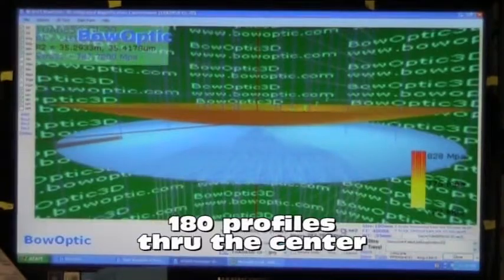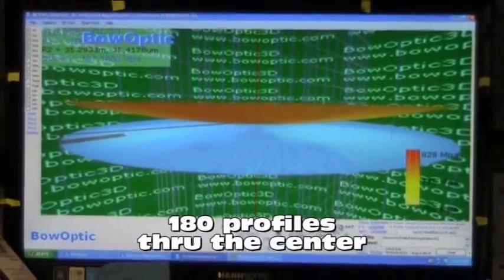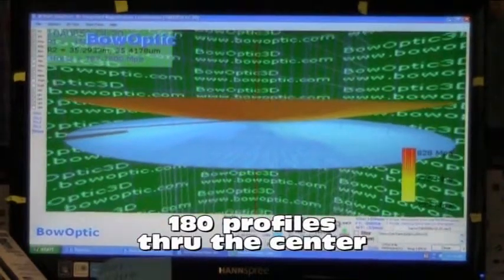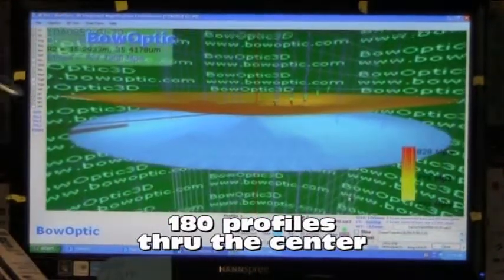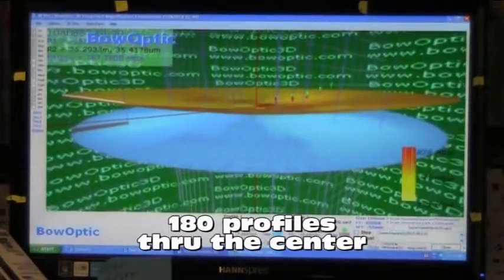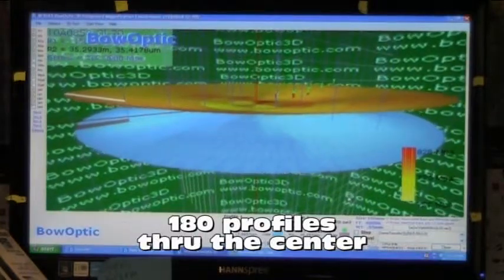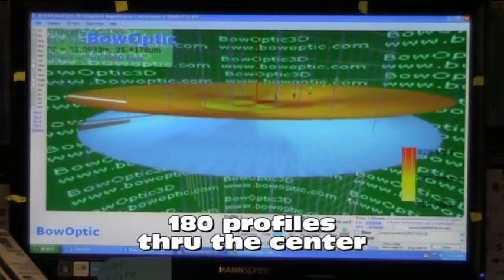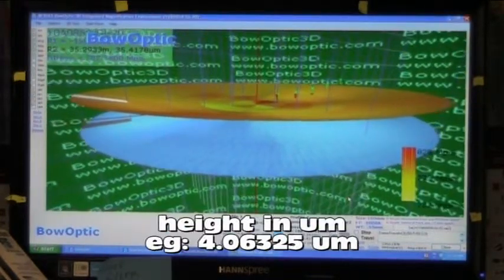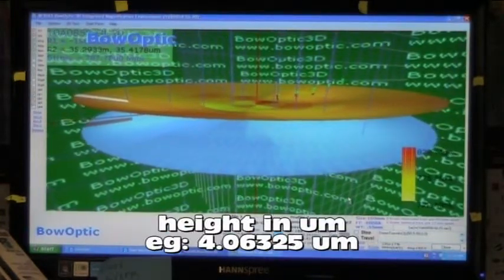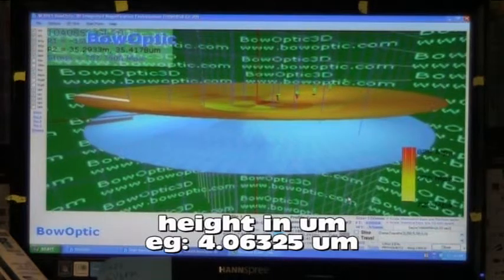The 2D profile is part of the output data of the BOW Optic 208. There are 180 2D profiles in the output data. Each profile goes through the center and has the height in micrometers.